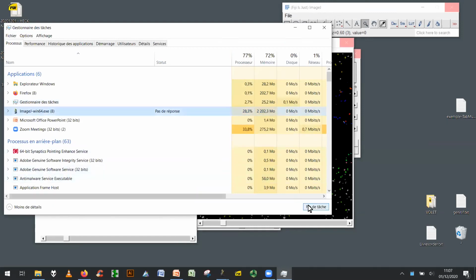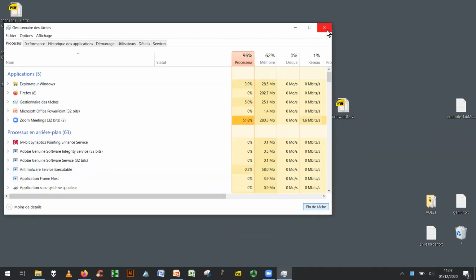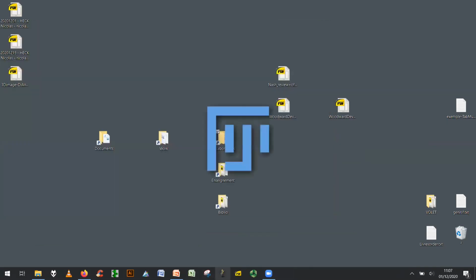I think I did. So you want to show? I come back. You want to show colocalization? Yeah, while Fiji is, yes, I will.